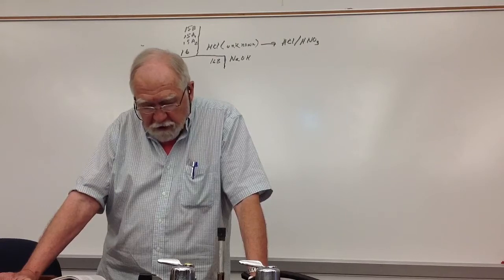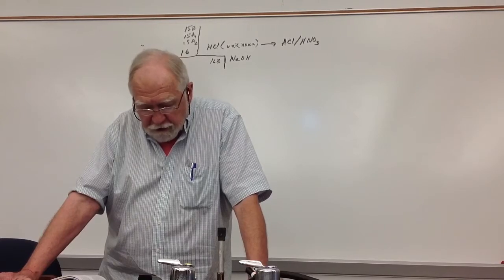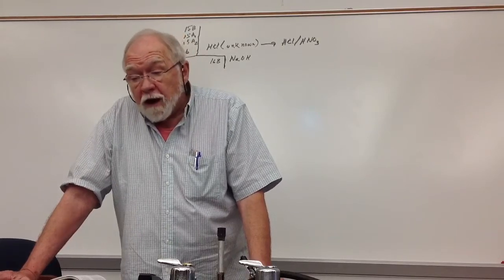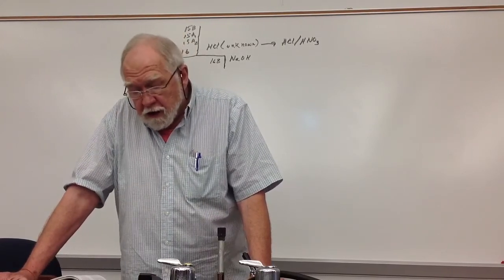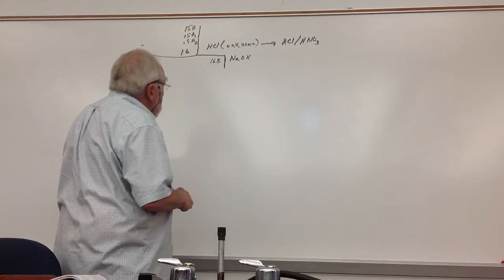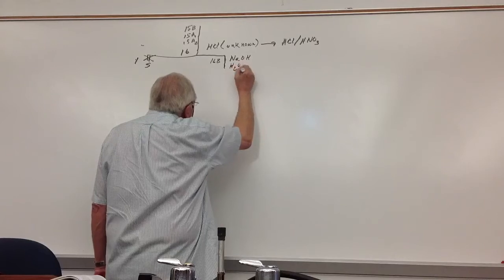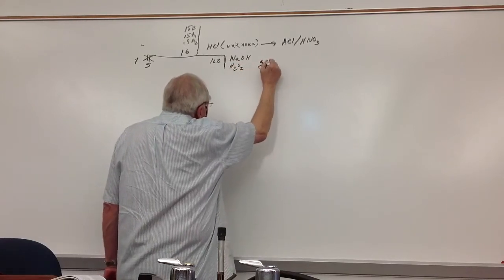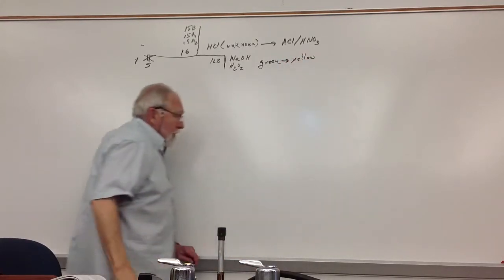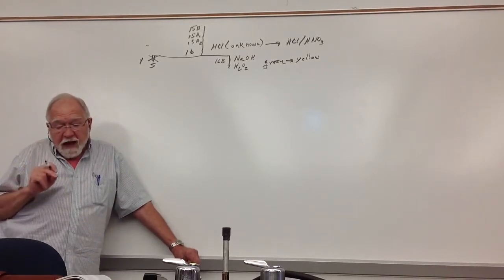So he says just add water, and I said add a mixture of water and sodium hydroxide at that particular step. This might happen mostly if you have a large amount of iron or something in your unknown. For medium amounts, it doesn't get too bad, okay? Unless you did a calculation. Then the other thing you were adding was hydrogen peroxide. The key thing you were looking for, which might be hard to see, is why I suggested doing the test by taking some of the solution out of your casserole, centrifuging it, and then adding the hydrogen peroxide.